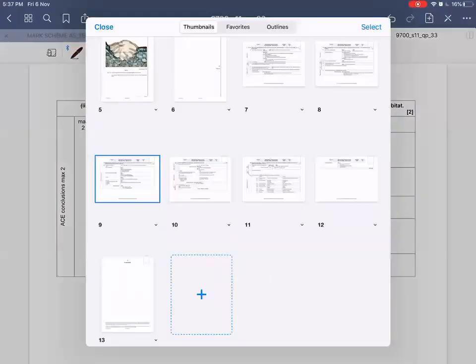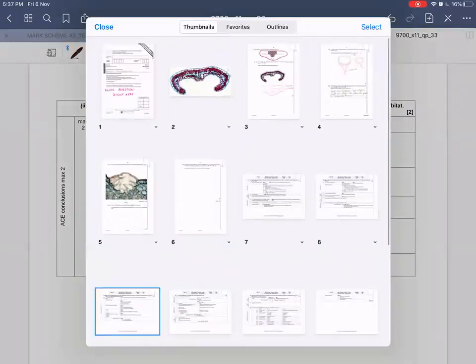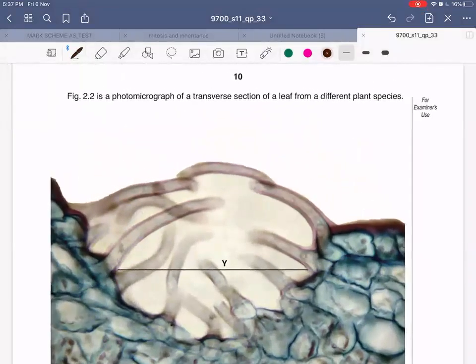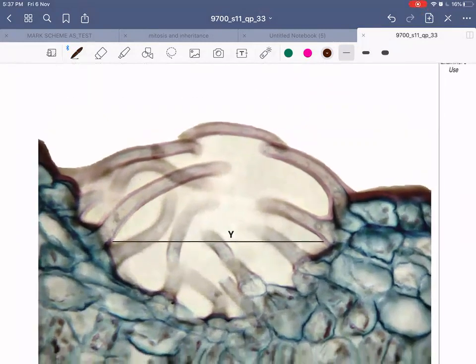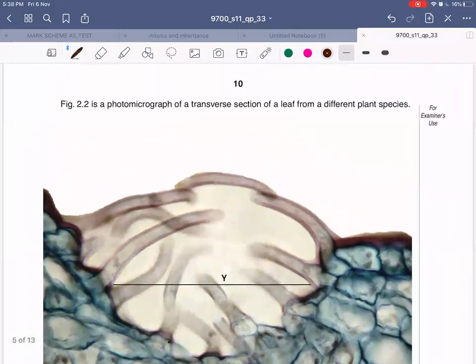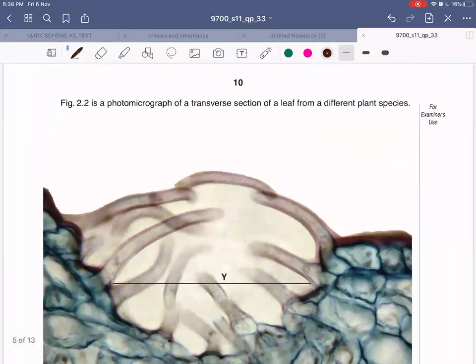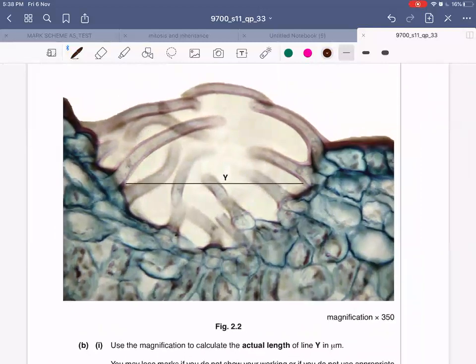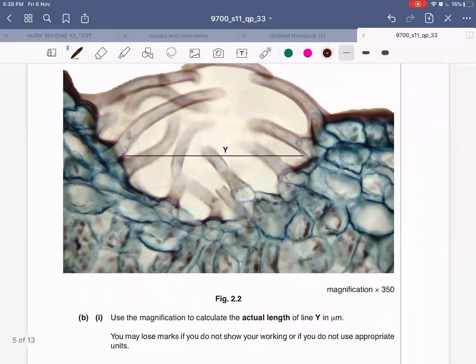This much is enough since the question carries only two marks. Moving on - Figure 2.2 is a photomicrograph of a transverse section of a leaf from a different plant species. It's good to see this recording since your slide booklet is in black and white. You can see trichomes and epidermal cells, but the entire structure of the leaf is not shown. This diagram is magnified to 350 times.